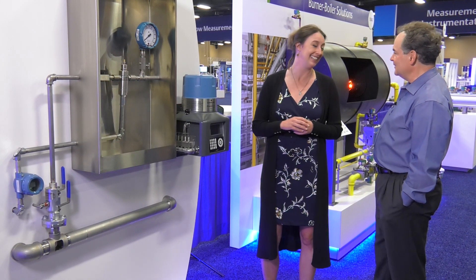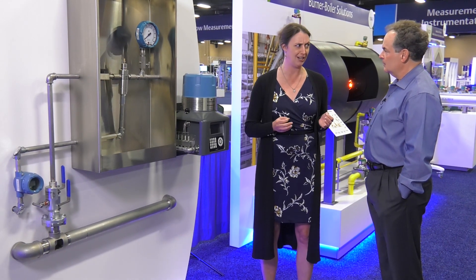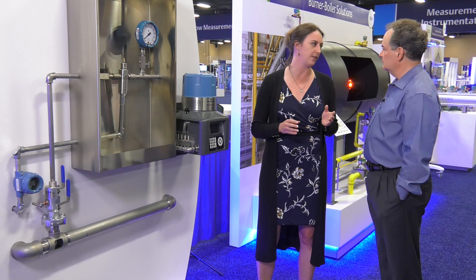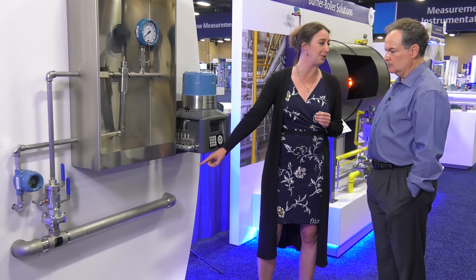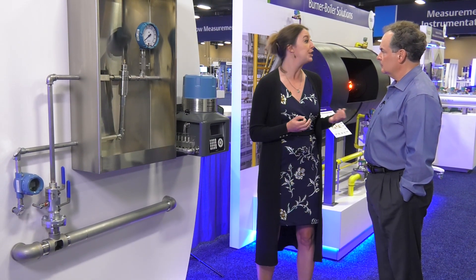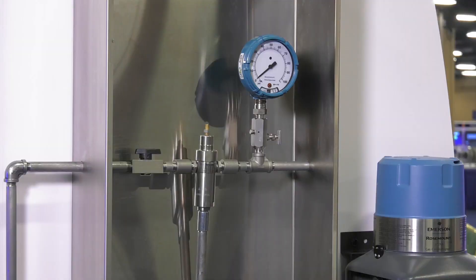Yeah, we're really excited about that. It's a game changer — it's completely different. Older models required the engineers to calculate exactly what wattage to install. To calculate a wattage, you need to use theoretical heat transfer calculations and assumptions, and it assumes that you know exactly what that sample is going through your process line. We don't always know that, and sometimes it changes over time. So calculating that wattage was very challenging for our customers. This takes all of that guesswork away because one unit can deliver the right heat every time.